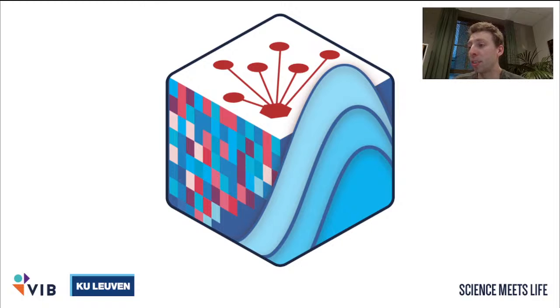Is it possible to access the final data used in the dot-plot heatmap? Yes, this is possible. If you want the actual code, please post this question again in a discussion, and I will send you an example of how to do this.